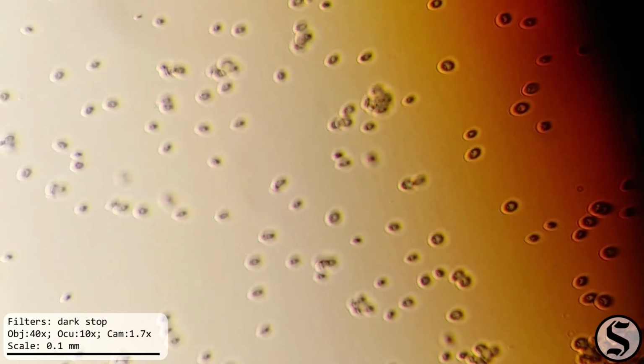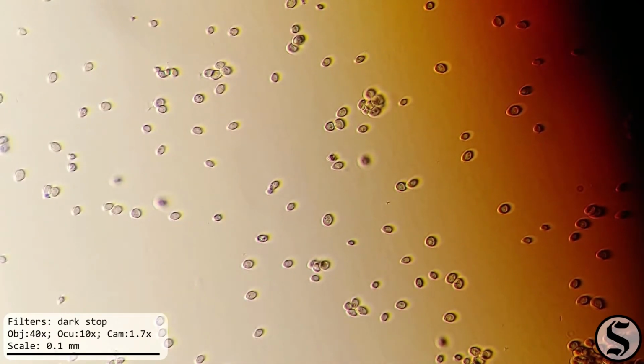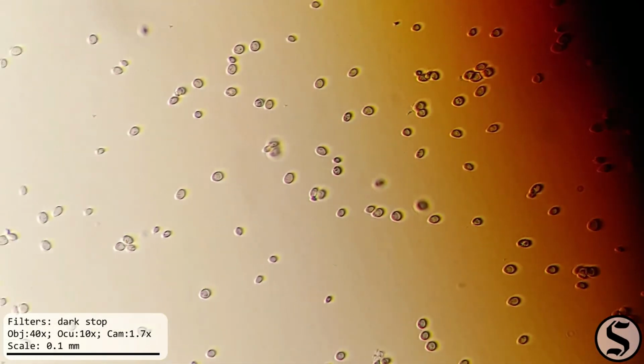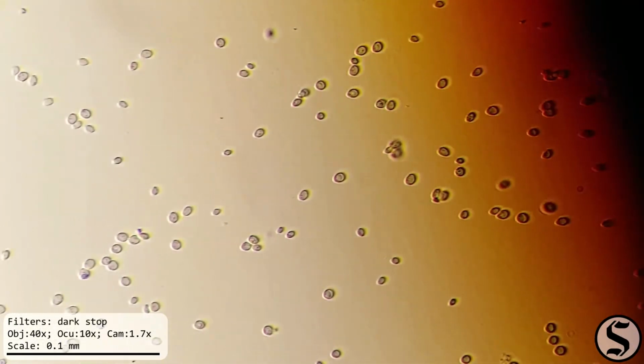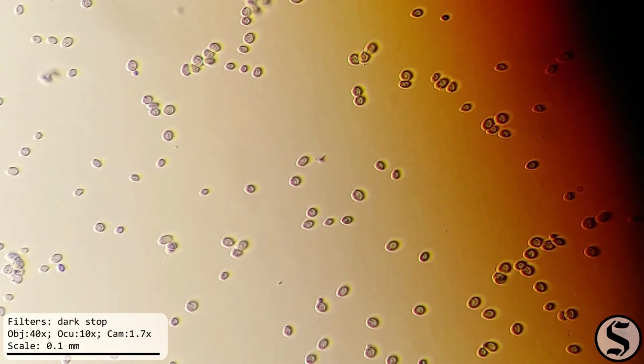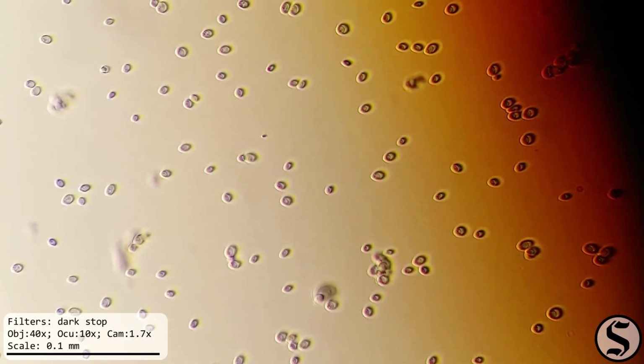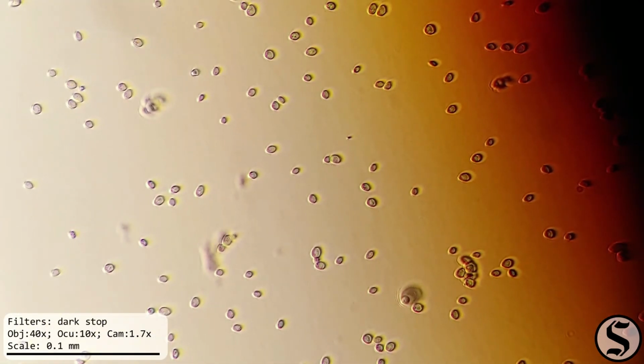And I also experimented with some other oblique illumination to increase the contrast on things. At the high magnification, we can see that it's giving us a lot better contrast, although perhaps a little less detail. Well, I thought that was a neat look at these microscopic little helpers that let us bake and brew.